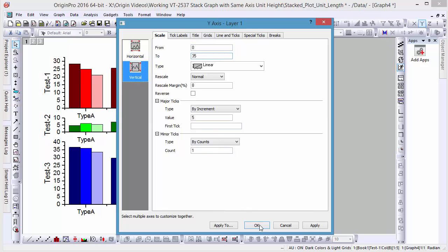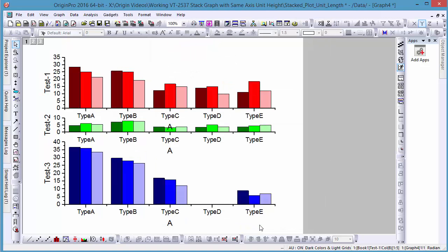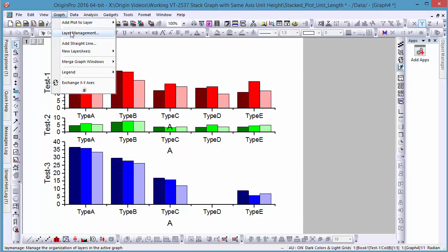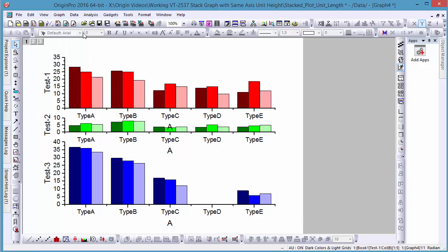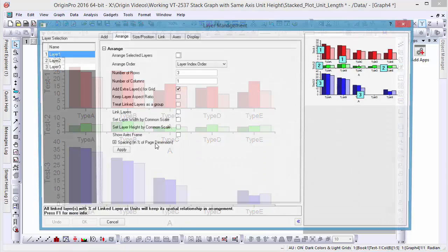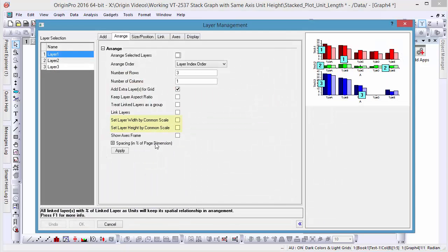Since we've made changes to the axes, we'll need to adjust our merged graph again to make sure the units are consistently labeled between all three graphs. To do this, let's go to Graph, Layer Management, and in the Arrange tab, check off the Set Layer Height by Common Scale box.